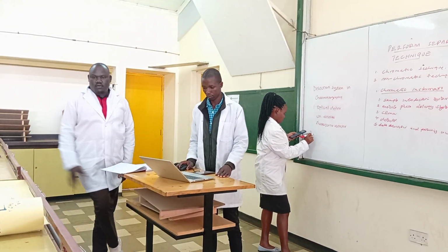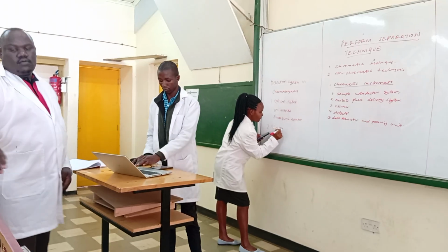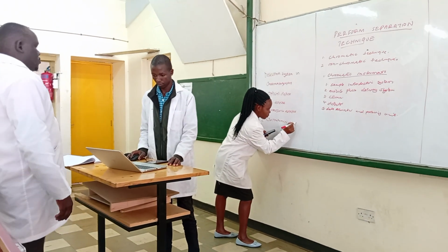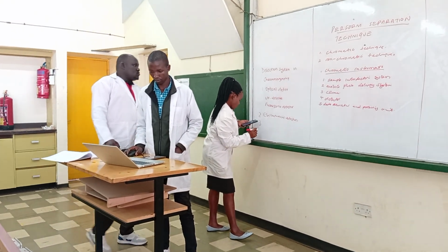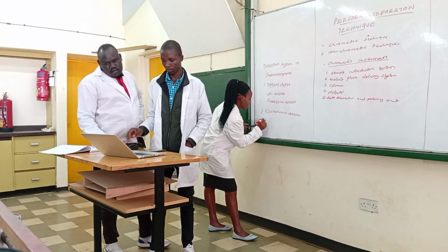Two, we have electrochemical detectors. And three, we have mass detectors, mass spectrometry.